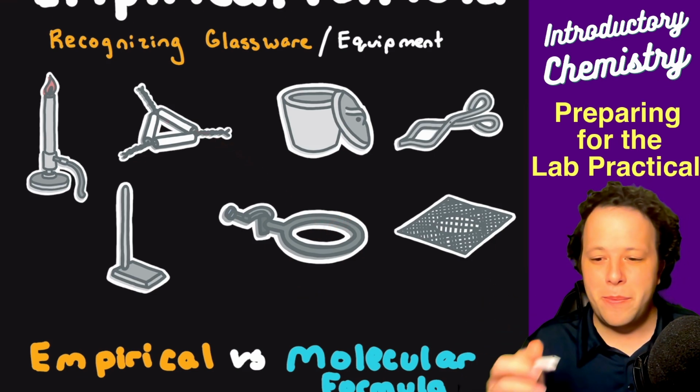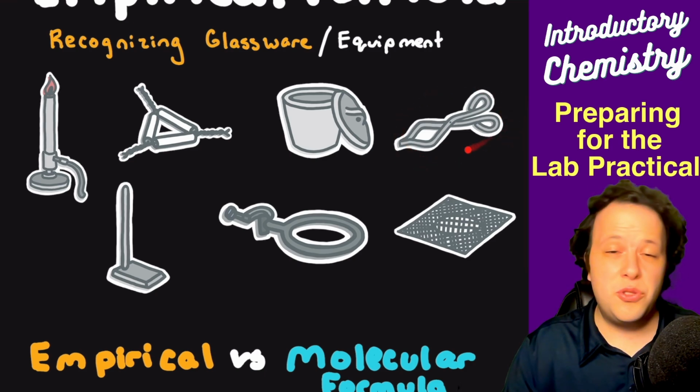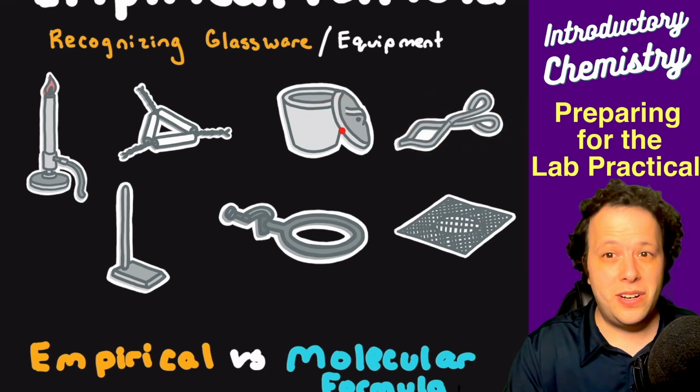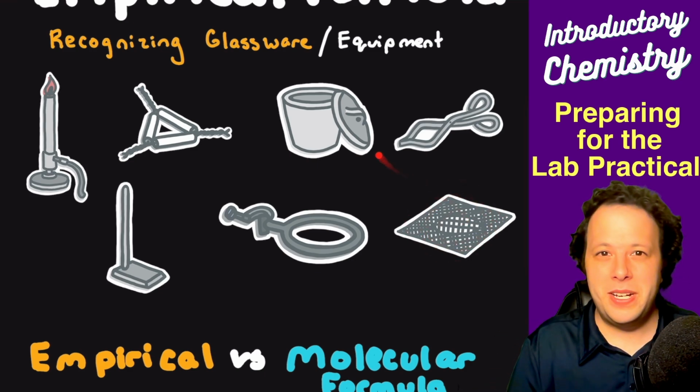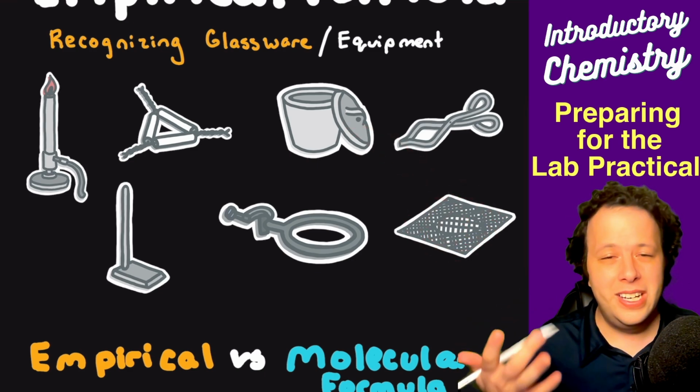So just kind of remembering that these things exist. There was the crucible tongs, which were used to take this off, because you remember your fingerprints never wanted to be on it. And then you had the wire mesh that you could sit that on to help cool it down. So there was a lot of things.